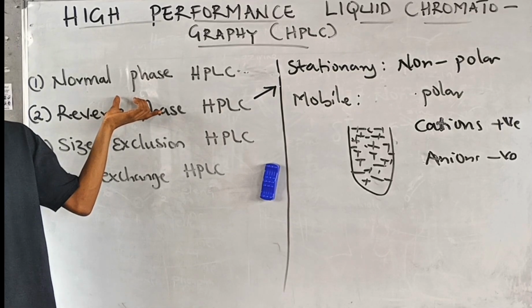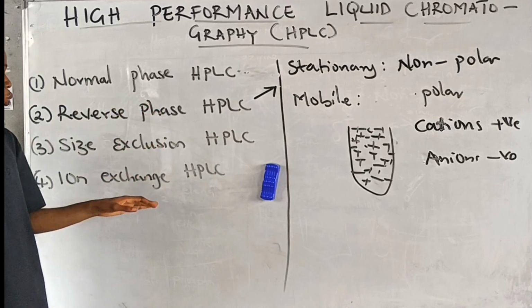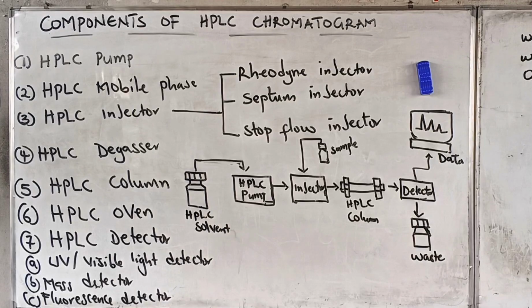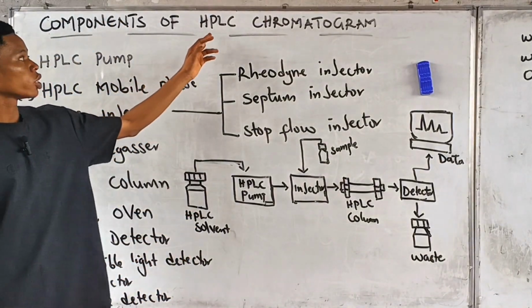That's hydrophobic interaction, right? This one is size and this one is charge. Do you understand that? Alright, so let's look at the components of the HPLC chromatogram.